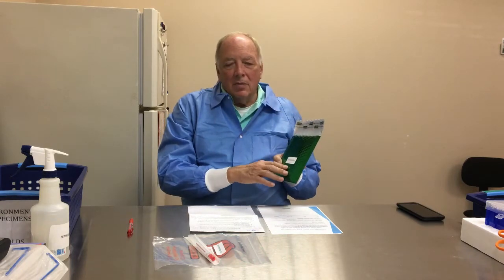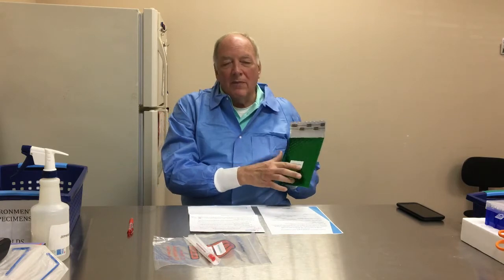The environmental kits will come to you in this kind of envelope — it will usually be a green color, but it could be a different color, so just make sure it says 'environmental' on the envelope.